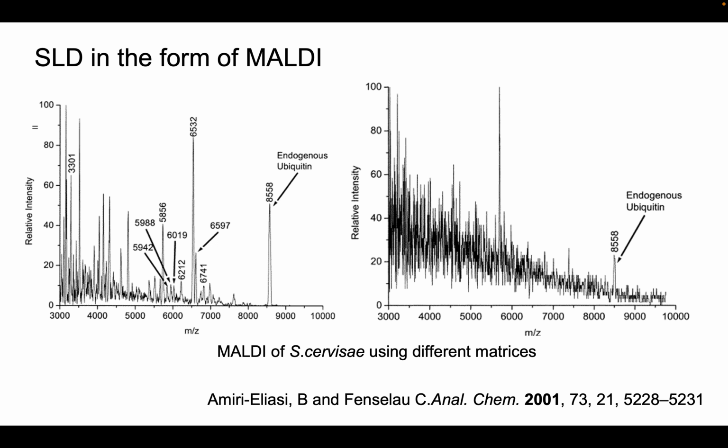A suitable matrix should be able to absorb the laser wavelength employed by MALDI, and it should also be able to gently ionize your analytes to prevent fragmentation. And it should also be able to yield a high signal-to-noise ratio where you want it.